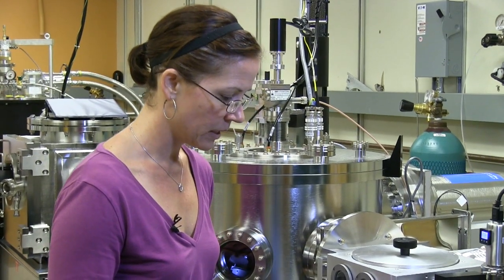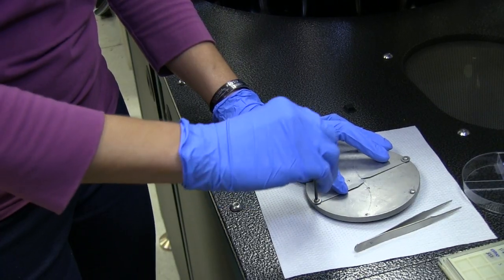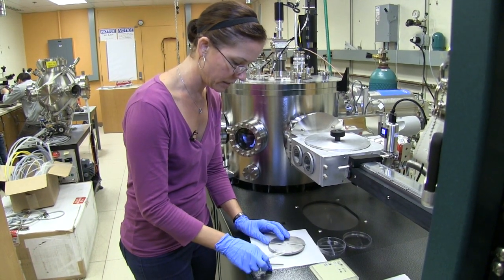So now what we're going to do is load the next sample carefully. Tighten the screw, making sure not to torque it too much. Then you move the other arm into place — I need to loosen it a little bit.